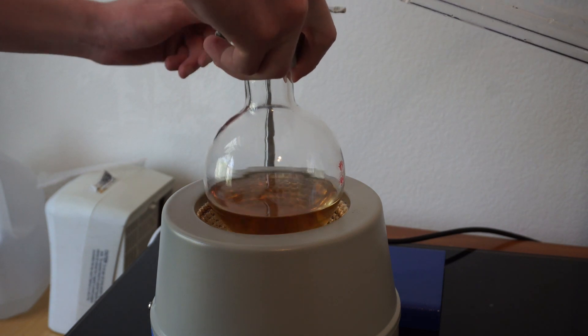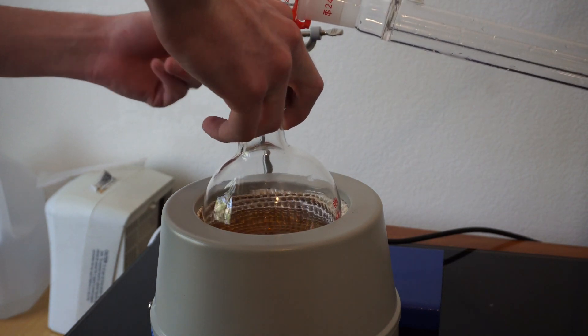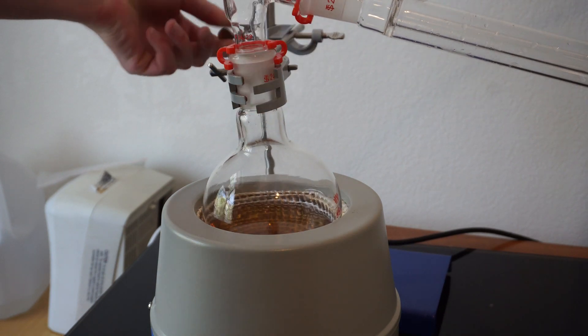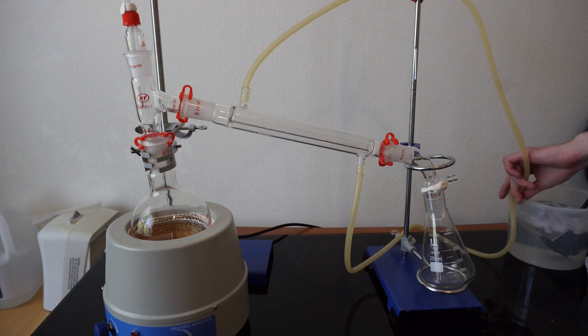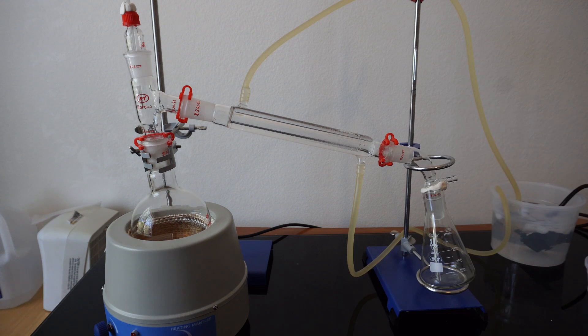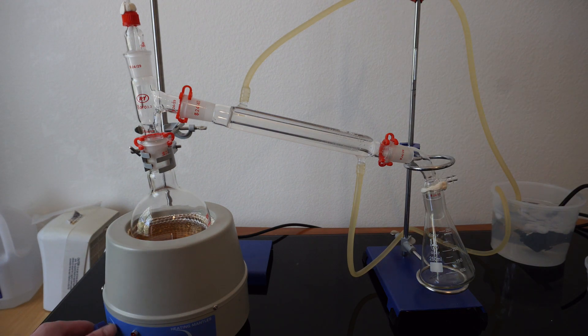I will then lower my boiling flask into the heating mantle to make sure everything is a good fit, and then turn on my water pump for my condenser. I use an ice bath of water to start out with, then will continue to add water to regulate the temperature. Followed by turning on my heating mantle.